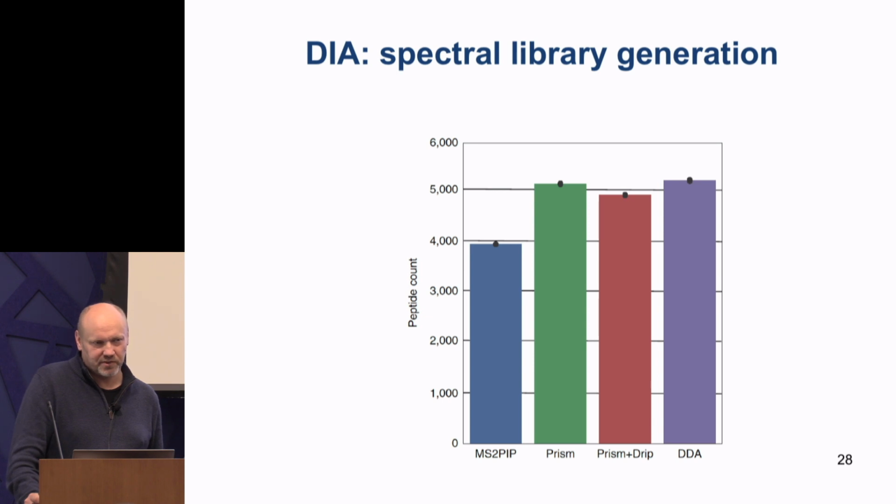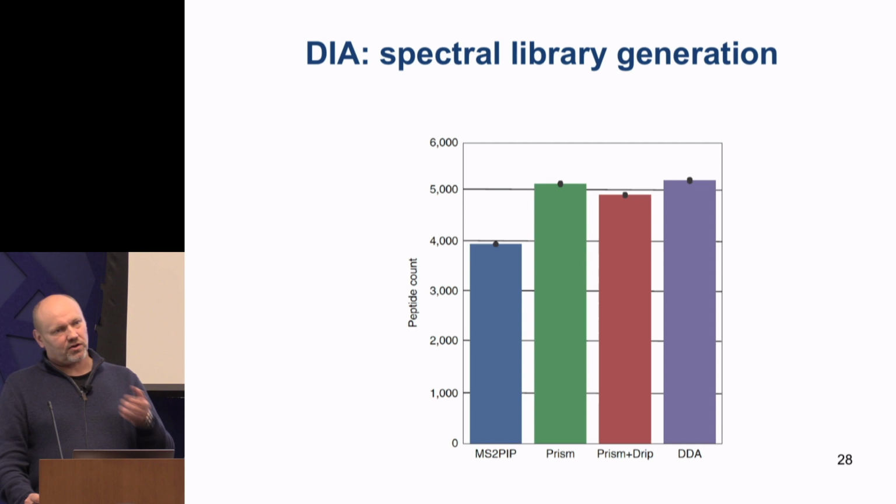So one can now do many things with this, right? You could, for example, if you have a library already measured, say, but on top of that I would really like to look for a few other peptides. For example, this is from a human sample, and there might be just a few SNPs in there which you didn't see when you made the library. You could just add them: you just mutate your peptide, get the prediction, and add it to the library.